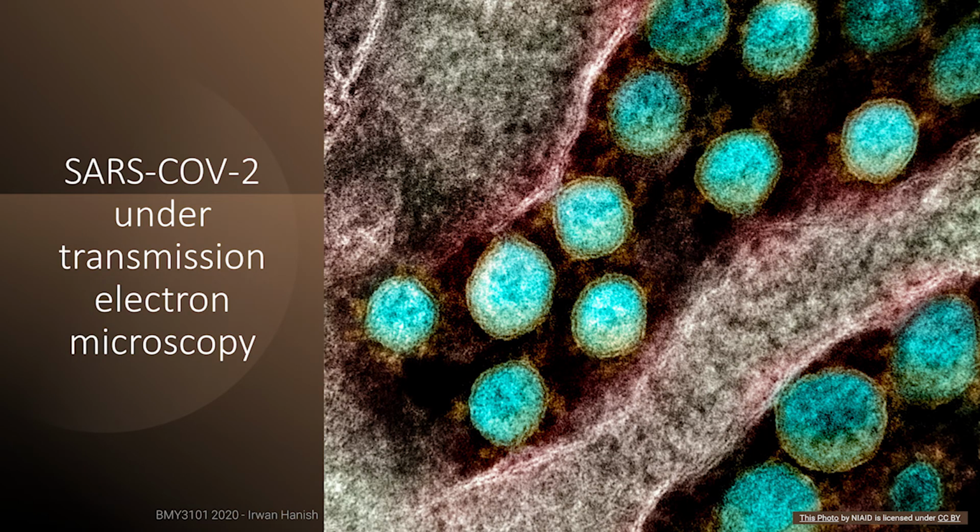The images that you get out of these microscopes are usually black and white, but often scientists color them digitally to help with the visualization of various structures to make them distinct from one another. Right? So that's it. Oh, this whole system of electron microscopy has to occur in the vacuum. You can't have air in it because the air particles will mess up the trajectories of the electrons. Right, so that's the transmission electron microscopes.